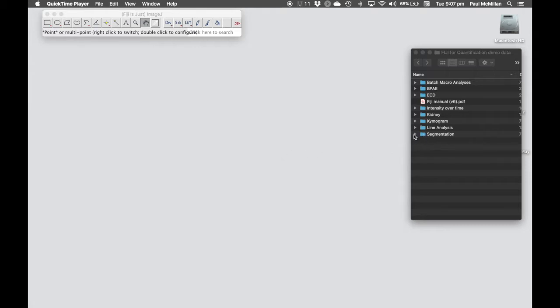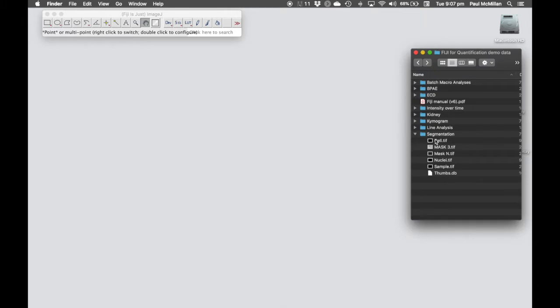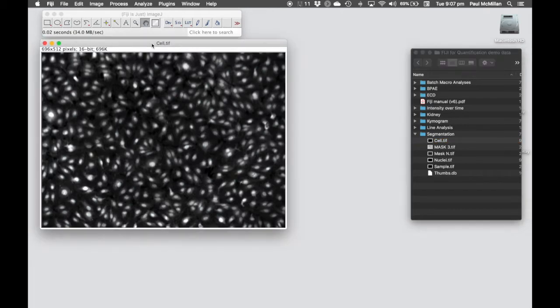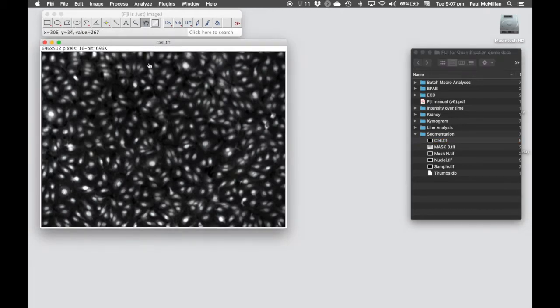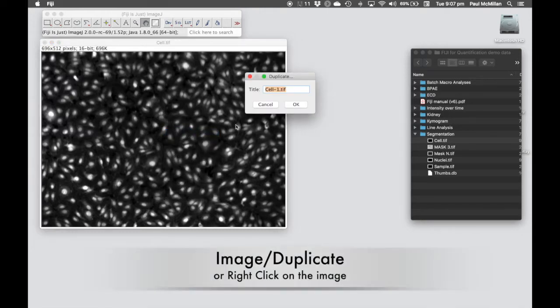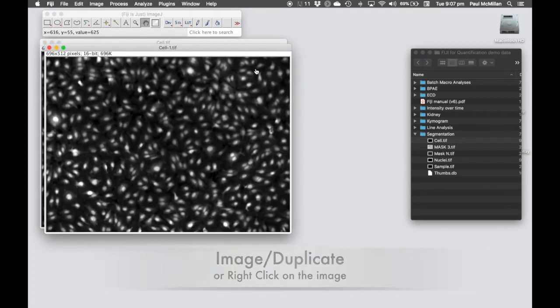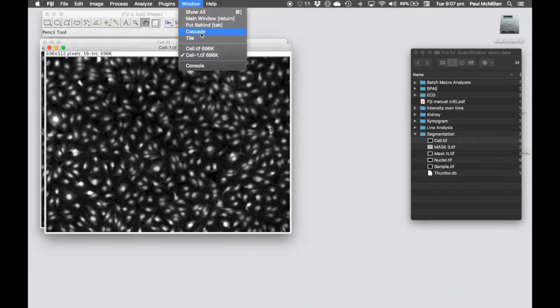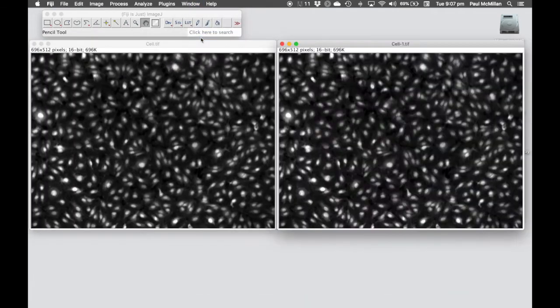We want to be in the segmentation folder and we're going to open up cell.tiff. The first thing we want to do is duplicate this image. I'm just right-clicking, hitting Duplicate, that name is fine, click OK, and let's just tile these.